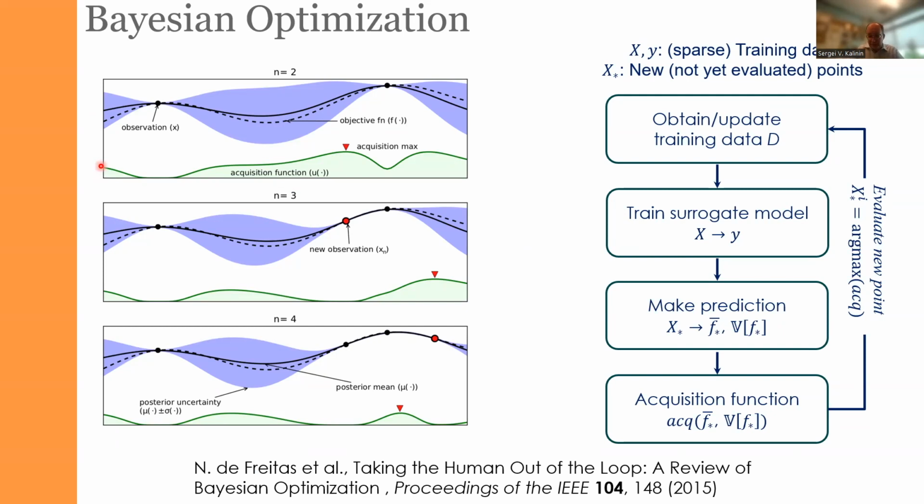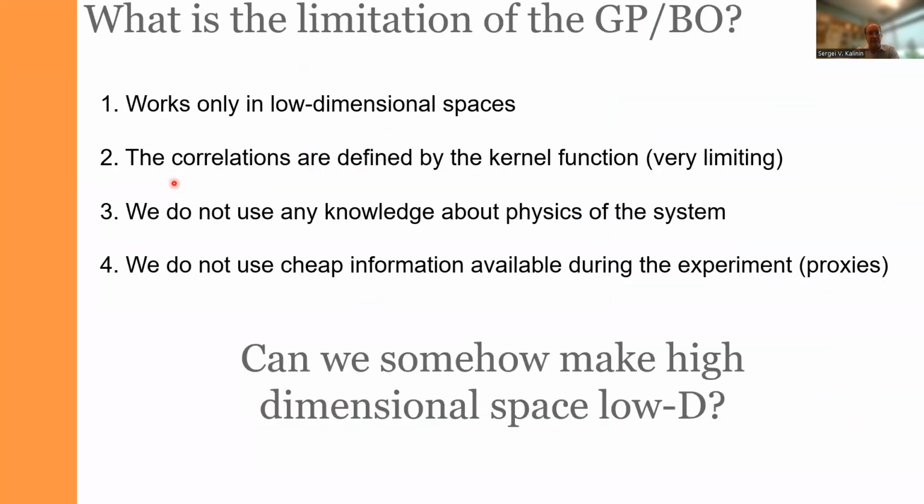We have something that we want to improve. However, the horizontal axis can be something more complicated. And the typical problem that emerges in the context of microscopy, either electron or scanning probe microscopy, is the discovery of structure-property relationships.